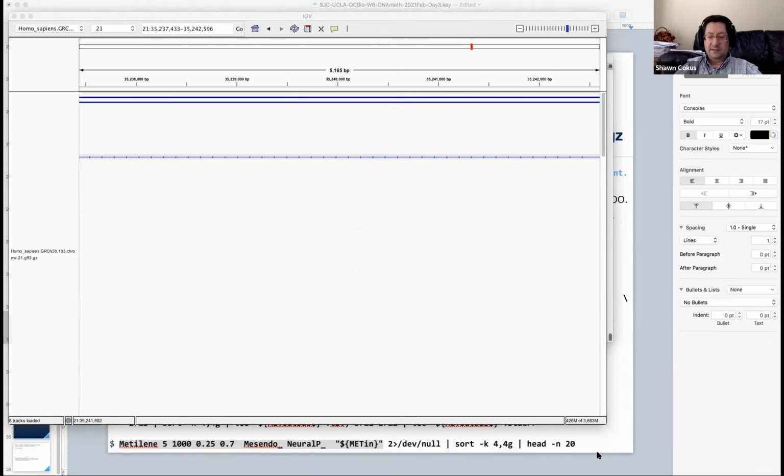All right, let me get Firefox in this. So. Okay, so now I need IGV, I need terminal, I need Keynote, I need, why do I not have a window with Firefox? That's within the list of things to share.